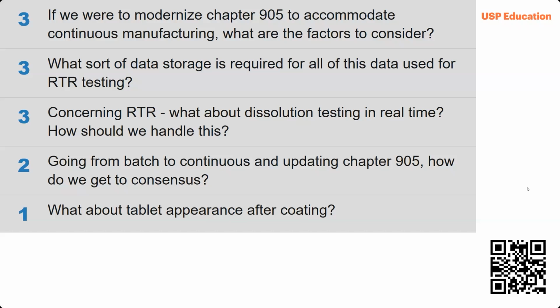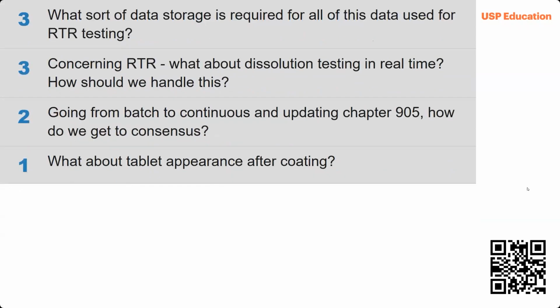I think it's a good point, and the next question here is about dissolution testing. We have not talked about two other critical quality attributes, usually dissolution and appearance of the coating, where you have little to no possibility to do this inline. But I recently saw a lot of publications about predictive models for dissolution testing, which have been accepted. I also recently saw an appearance tool which has been tested and looked promising to me. I think we will see more opportunities here as well.